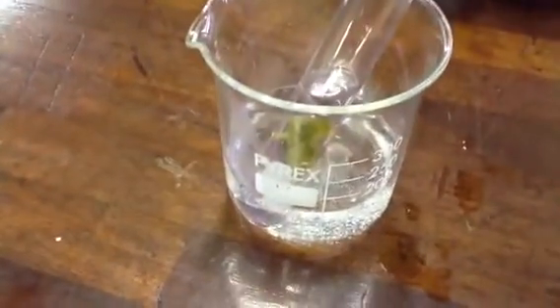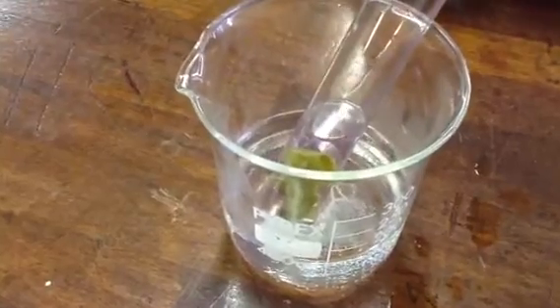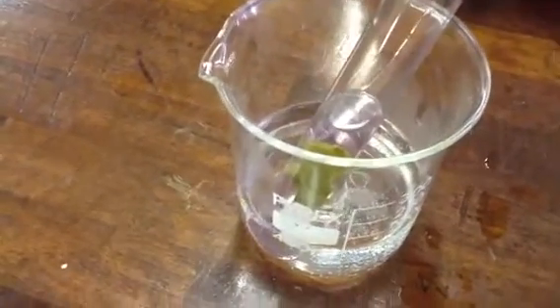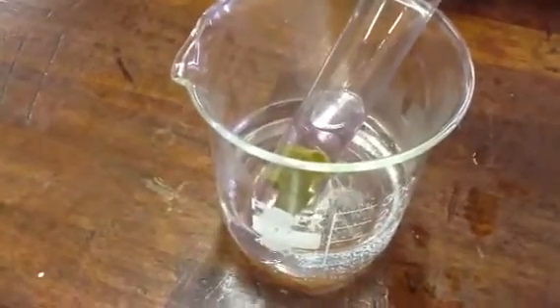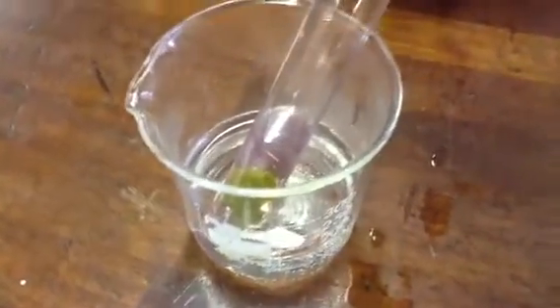Sarah, why are we using a hot water bath to heat the alcohol rather than a Bunsen burner? Alcohol is very flammable, so it's safer. Yes, it is very flammable and it's a much safer method of heating. So next, we are going to examine one that we prepared earlier and move this one to the side.